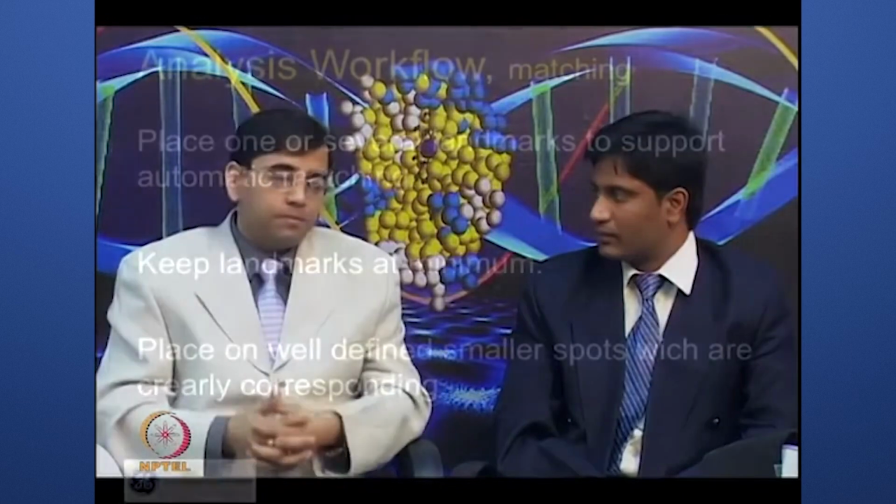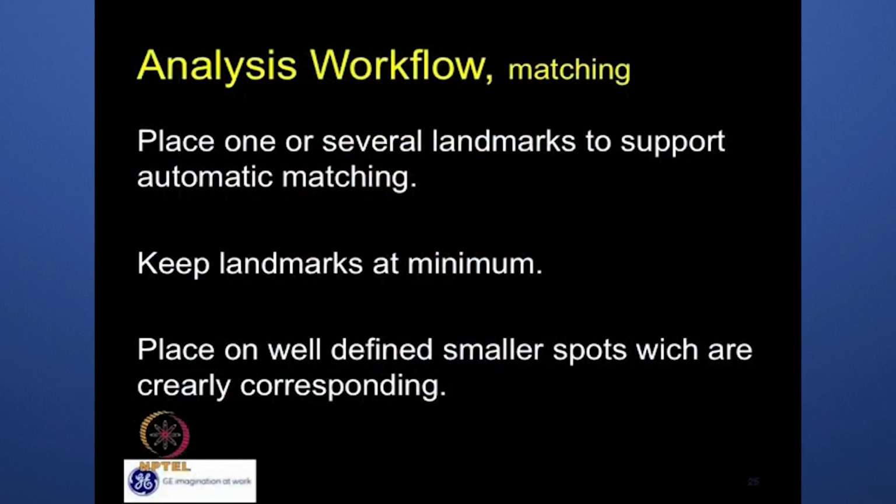So I think it will be useful to have the landmarks in various regions of the gel. Exactly, so that one can align all the different gels by using these landmarks. Place them on well-defined smaller spots which clearly correspond. If it is a little bigger spot, it may not take that particular area in the other gel also. So as minimum as possible, try to put landmarks on a small spot. This is another important thing.